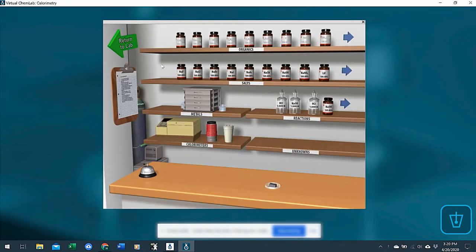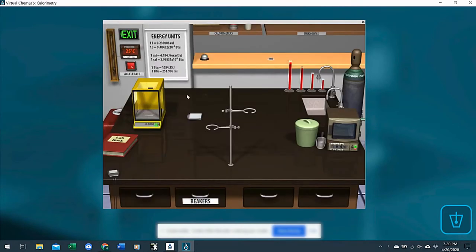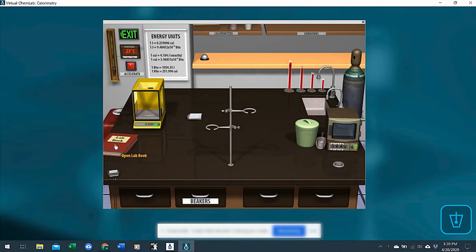Now they have an unknown metal here, they don't know the identity. They could set up a whole calorimeter setup with the water, and then put the heated block in, test it, and then they can report to you what they calculated.